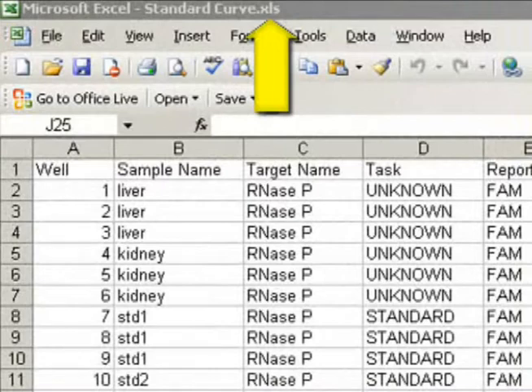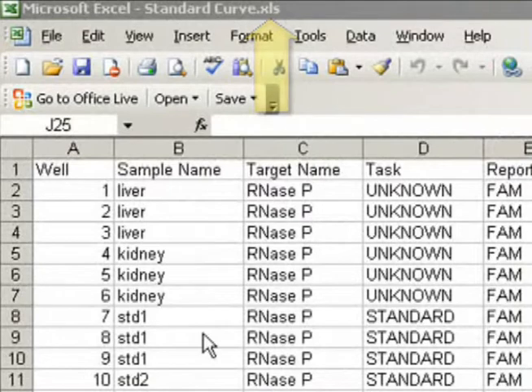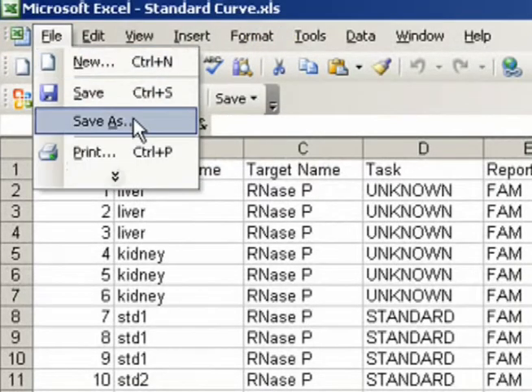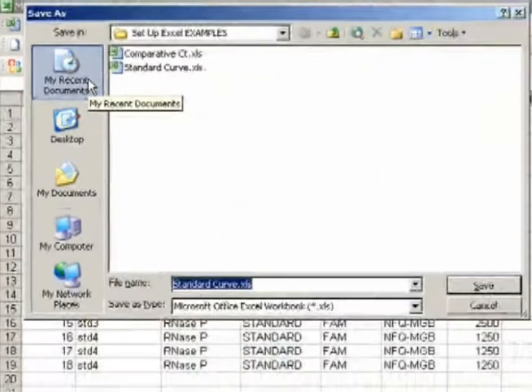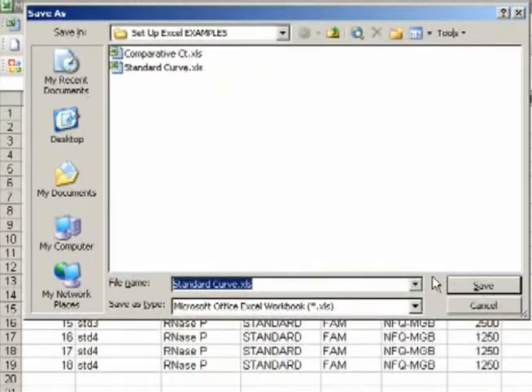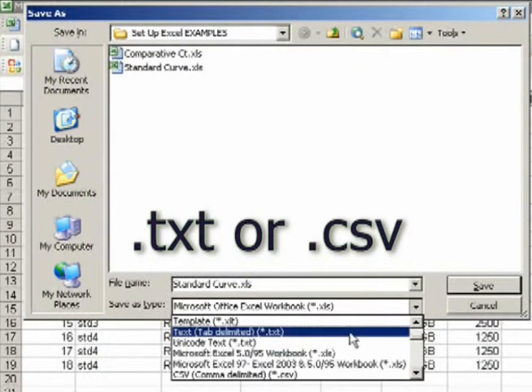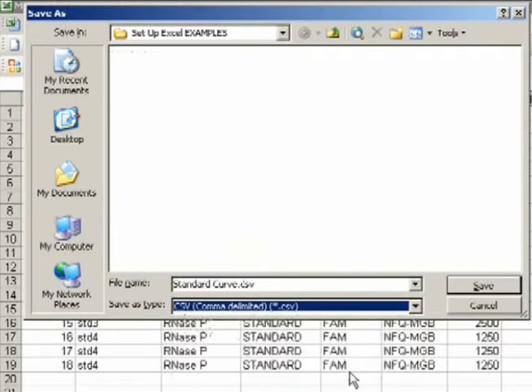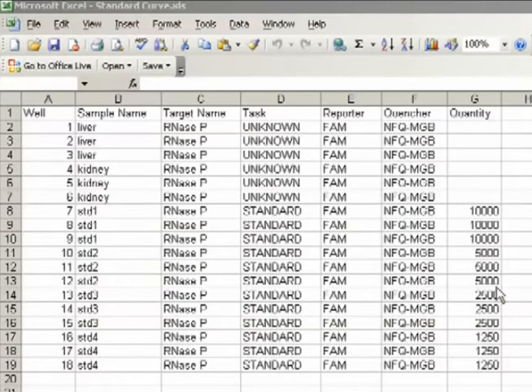But for importing directly into the VS7 software, we actually need a different file format. So I'm going to do a quick File, Save As, then change the extension to either a .txt or .csv, either one. I can save this to the same folder without changing the file name.